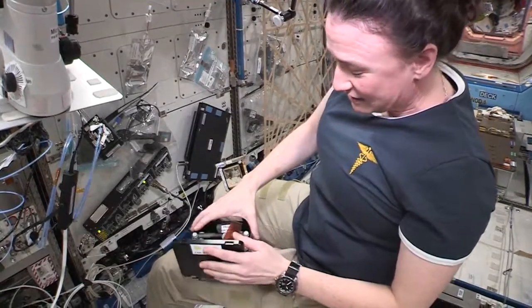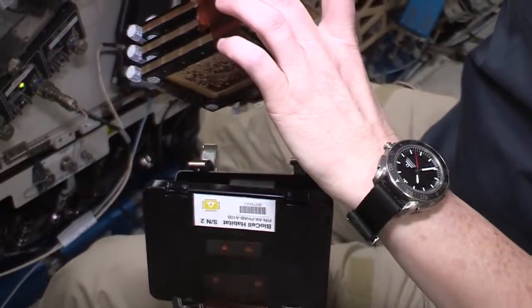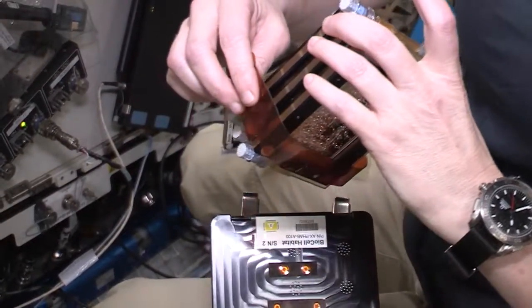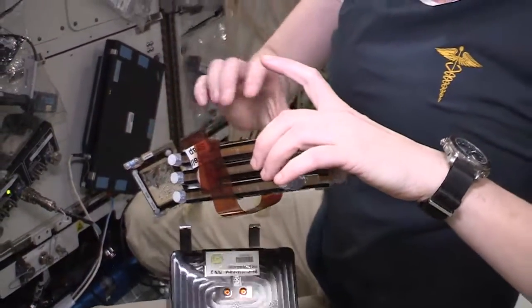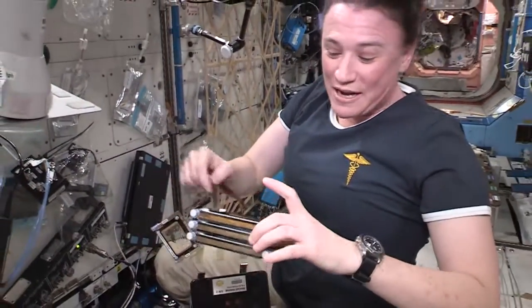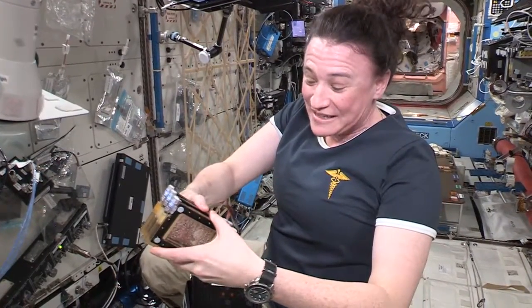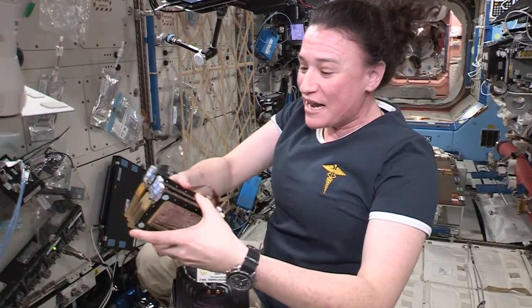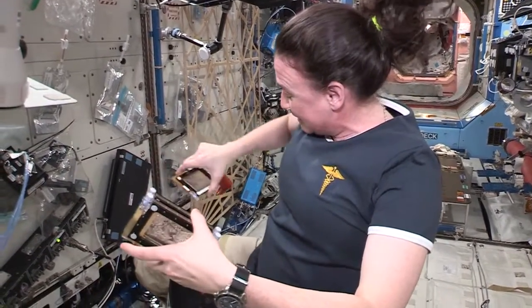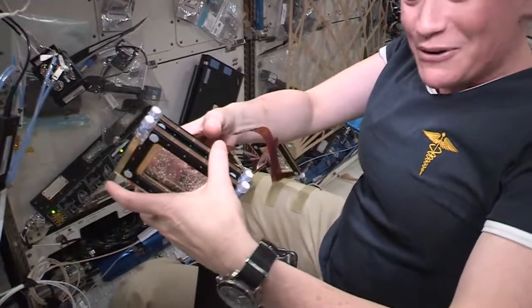This is where all the cells live in their Biocell Habitat. And when we're done working with them, we put them in something called Sable 2, which is up in the ceiling for ISS. And it feels all nice and warm and comfortable because it's just like the temperature of the human body. And so we let the cells live and grow there, and we've had them for almost 2 months now up here on ISS. We feed them, we give them nutrients, and they basically live, they're like miniature crew members living with us.